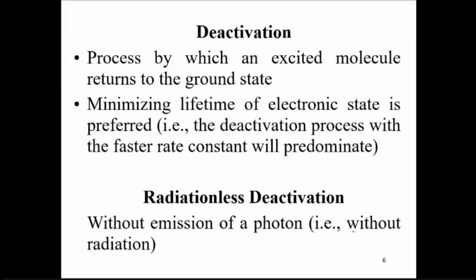The process by which an excited molecule returns to the ground state is called deactivation. Minimizing the lifetime of the electronic state is preferred. That means the deactivation process with the faster rate constant will predominate.